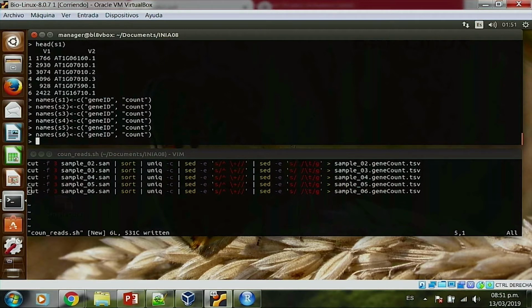I know this is very labor intensive because you have to write each line every single time. If we were to use the tools that we've already learned so far, for loops, we could do all of this in just 2 or 3 lines and just repeat it. But we're just doing it by hand. There are not that many lines to it. If we had like 100 files, yeah, probably it would be better to use a for loop. But we only have 6.